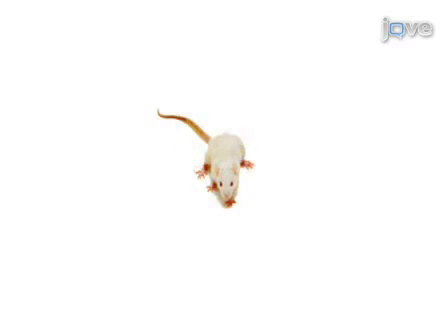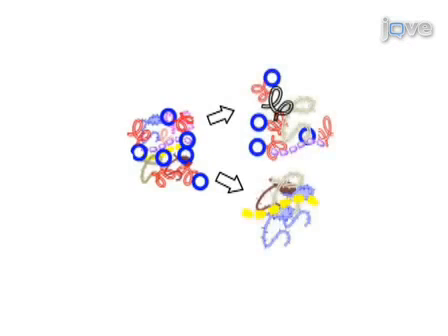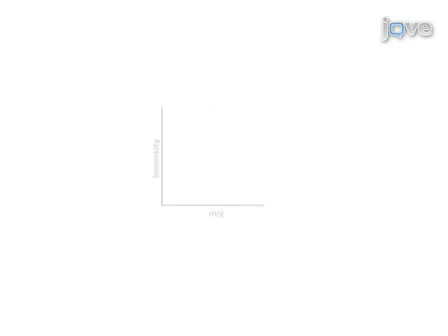Next, proteins from purified rat brain lysate are incubated with the C-terminus of P2X2 receptors bound to glutathione Sepharose beads, and protein complexes bound to the C-terminus of P2X2 receptors are isolated via SDS-PAGE gel electrophoresis and excision, and are identified by mass spectrometry.